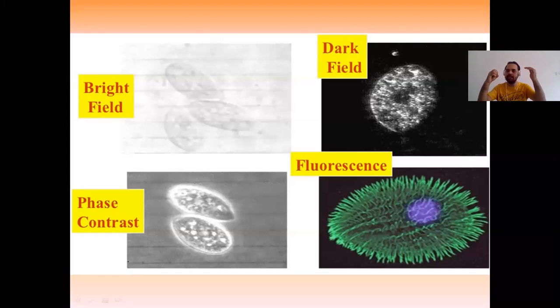When light is projected on any material, that sample will absorb the light that is falling on its surface, and the same amount of light will again be emitted out. It is not reflected, but it is emitted out. So that amount of light which is captured is then given back.